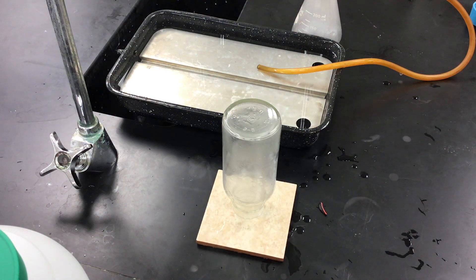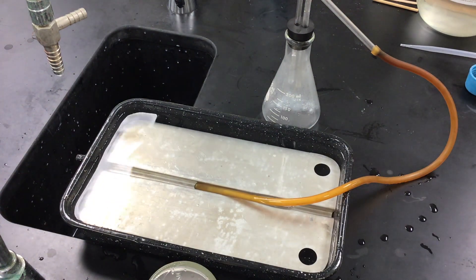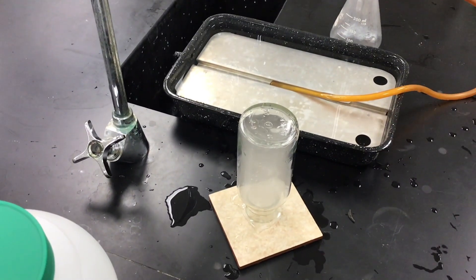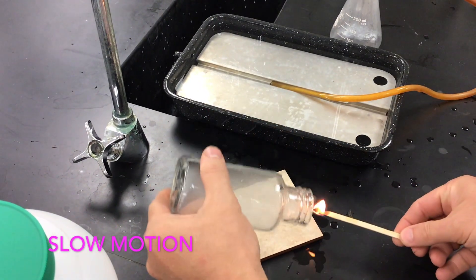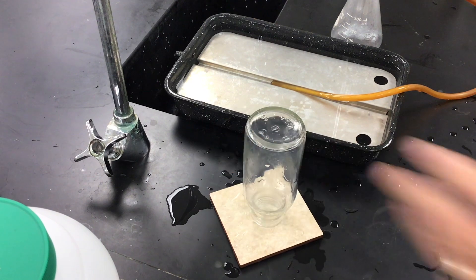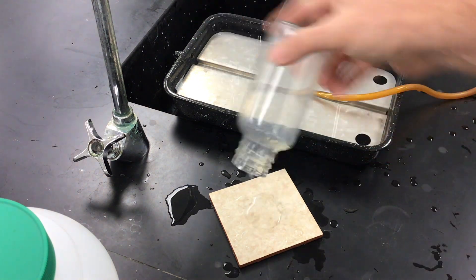Nothing happened — let's try it again. Move it quickly over here. Wooden splint. Let's move this back so we can see it better in case something does happen. We'll get it lit again, hopefully this time. It takes a little bit of time to prime the system. What you saw there was hydrogen gas being produced and a little flame that should have shot out from underneath the bottom of the bottle.